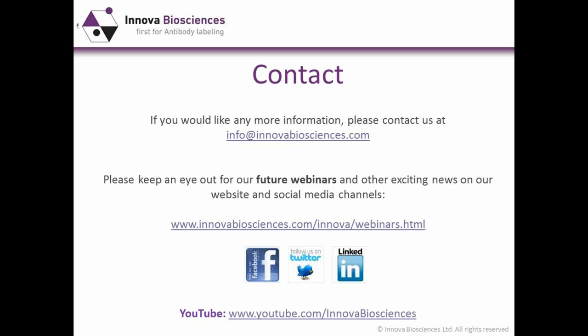Okay. And our next question is, how long can I keep an antibody following labeling? I will assume that means with the Lightning Link kit. Generally, conjugates made with Lightning Link are going to be stable for a long period. I think I mentioned it's a covalent bond. It's a very stable bond.